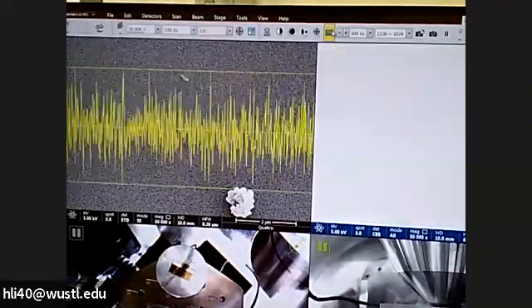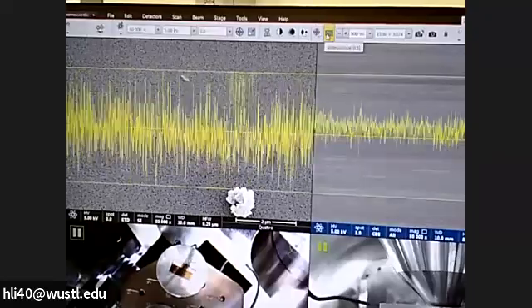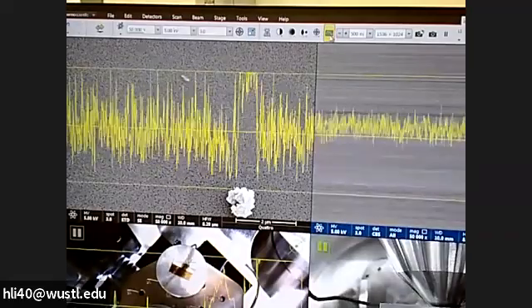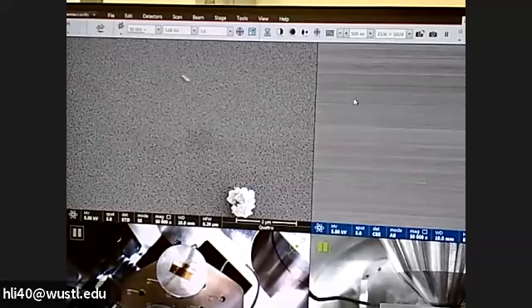Okay, so now after you adjust this kind of thing, it's ready to go. Another thing is, for this system, if you use the shift key, you will automatically apply the option you choose to all the windows. So for example, now if I hold the shift key on the keyboard and click the video scope, both of them will disappear. If I want both of them on, it will do the same. Okay, so this is how we fine-tune an image.